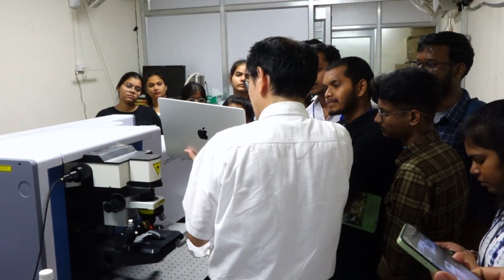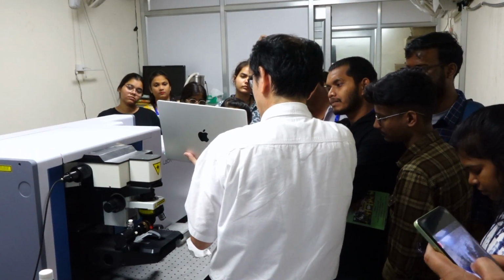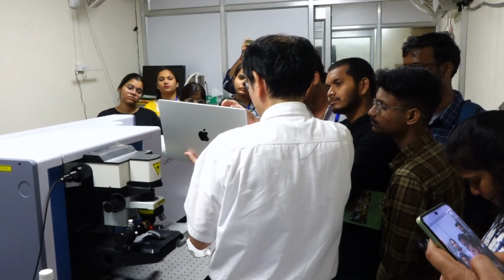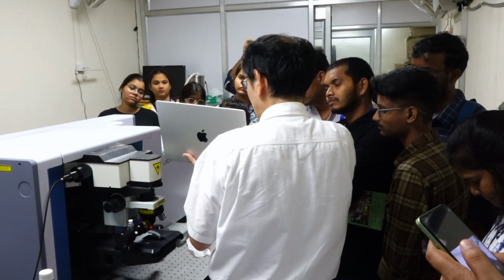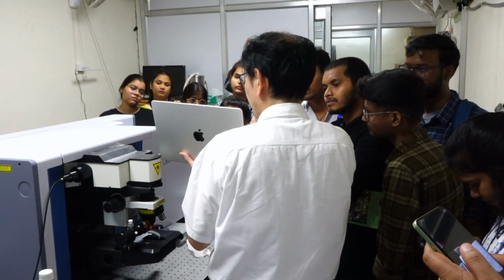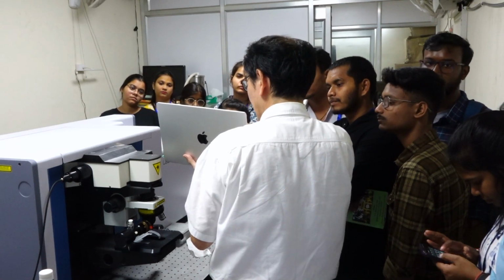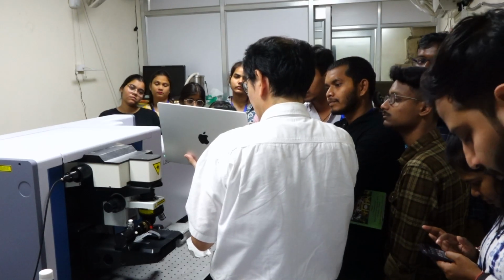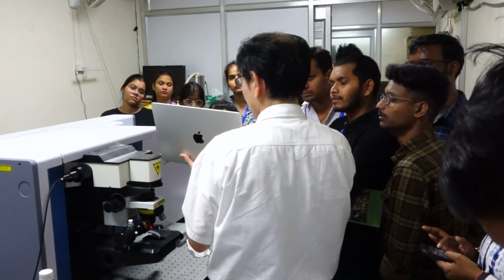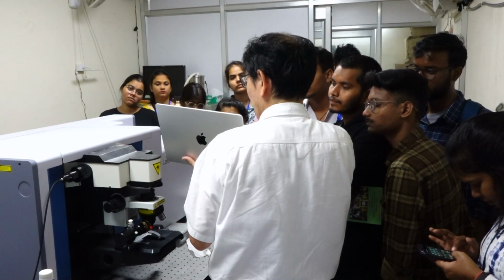But if the SN ratio is 1000 times better, then a one wave number shift will be clearly detected by calculating difference spectra. So the first priority is to get a good spectrum, then do good data analysis. Then we can get much information from the spectrum.